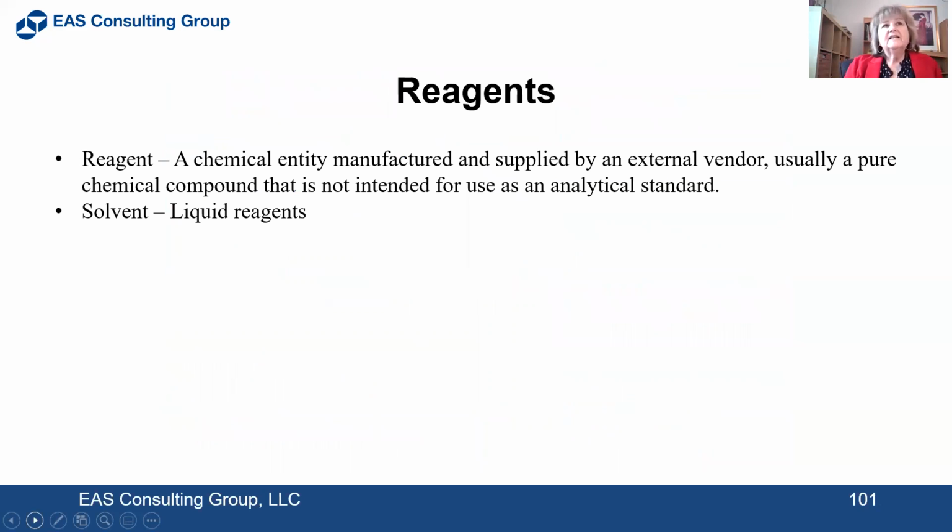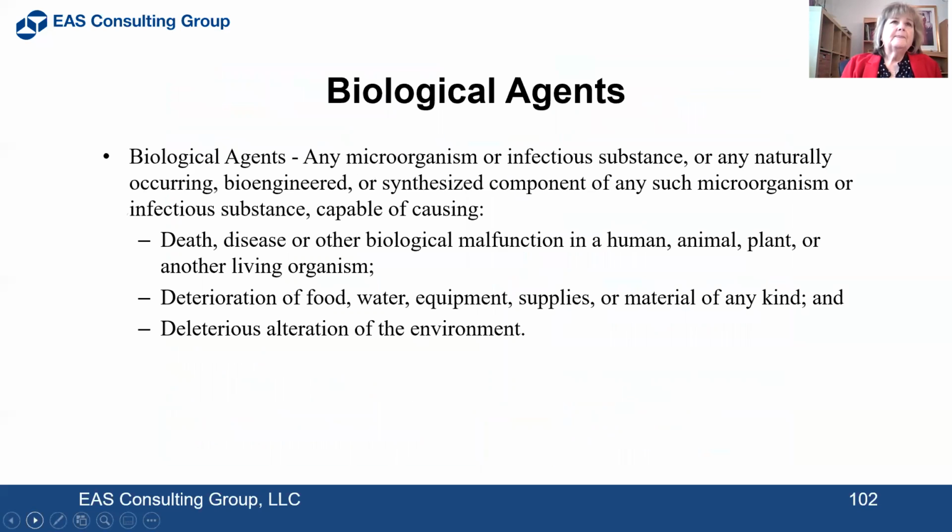A reagent is a chemical entity manufactured and supplied by an external vendor, usually a pure chemical compound that is not intended for use as an analytical standard. And then a solvent is a liquid reagent.